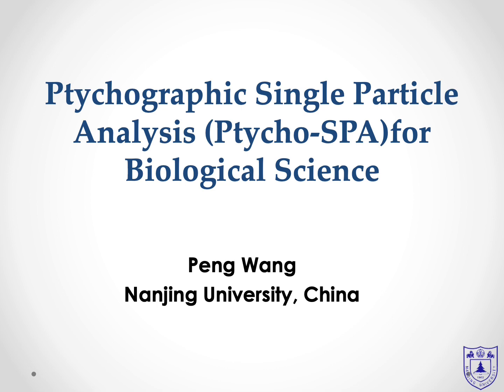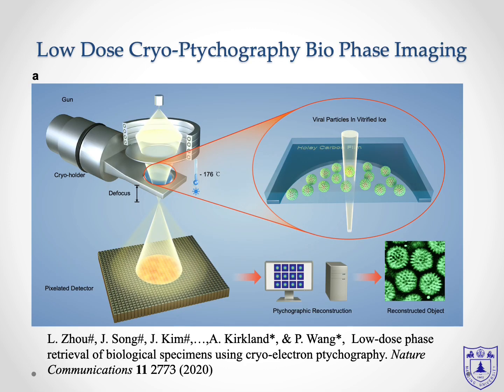My presentation is about ptychography single particle analysis for biological science. This is a schematic diagram of the optical configuration for ptychography. Ptychography data was recorded in a scanning electron diffraction mode. Diffraction patterns were recorded on a Medipix 3 direct electron detector.